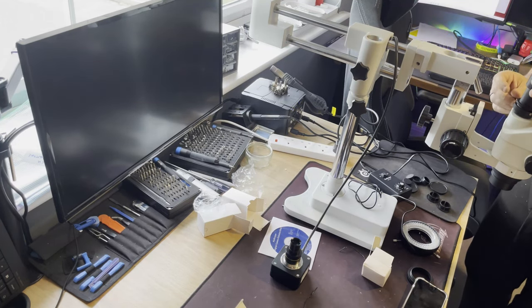Hi guys, so a quick update on the microscope. I've checked online, checked with a couple of colleagues. So here now is focusing just fine. It's all good. It was a question of adjusting a little bit. The camera, it's also focusing, but is not really that great.